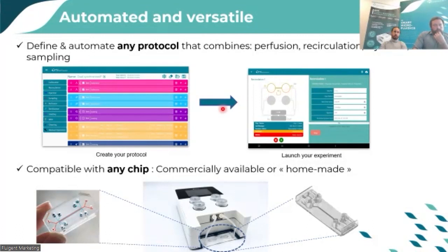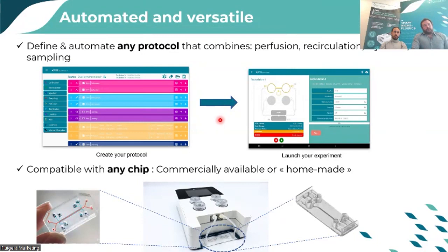Also, in terms of chip compatibility, OMI is totally versatile. You can connect any chip that has one input and one output, and it will recirculate through this channel.